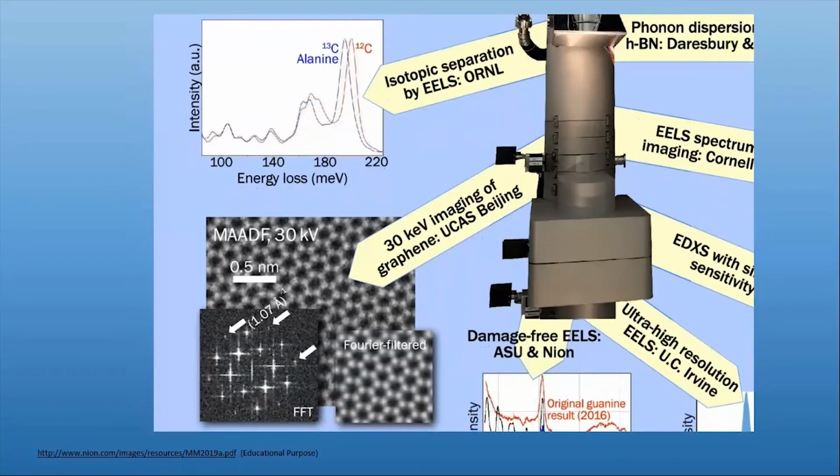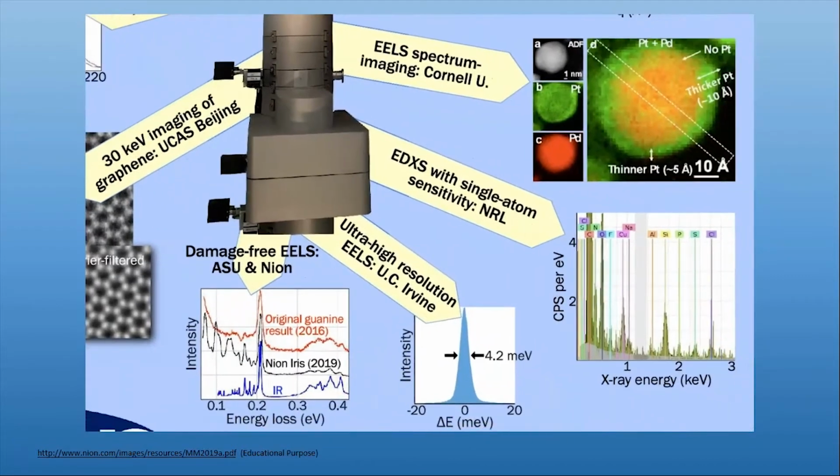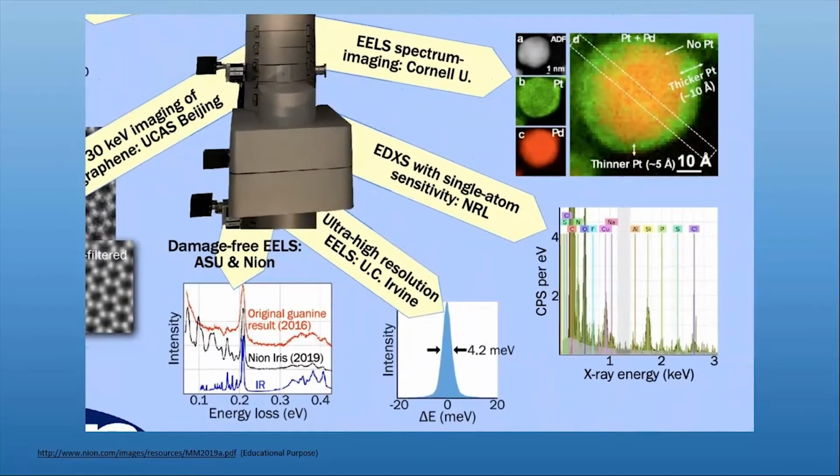Here is the electron energy loss spectrum, which acts like a fingerprint for materials and atoms. Here is an amino acid in that same EELS scanning. The EELS spectrum can actually show atom by atom positioning of each type of material. For where this fails to recognize a material, there's also X-ray scanning, which between one or the other can identify the material and its placement.